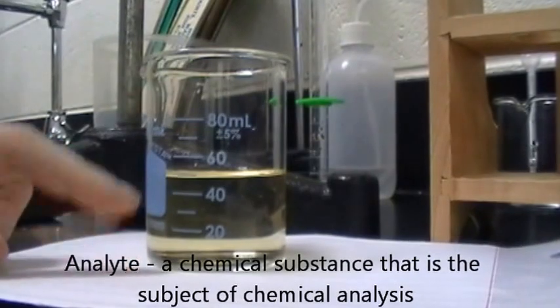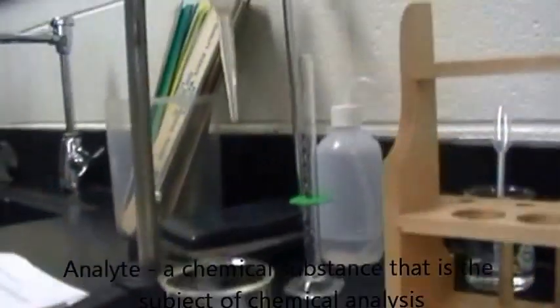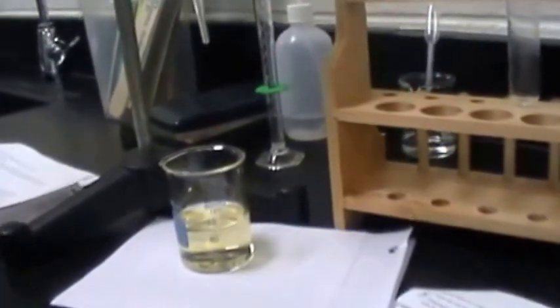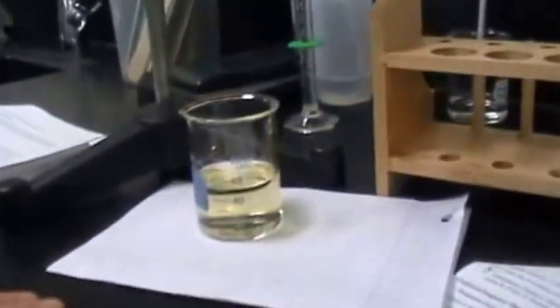Analyte. So after each drop we're going to measure the pH in our lovely chart, and we have our nice pH meter right here. That way we can record the pH of this analyte when it is neutralized, when it changes color. I think that covers everything.